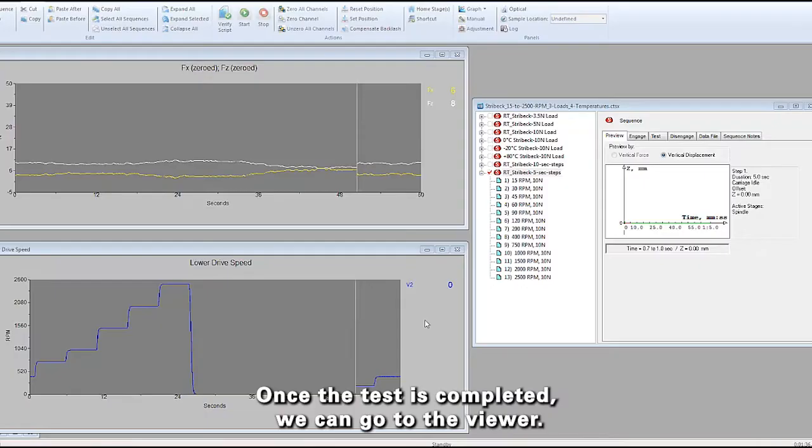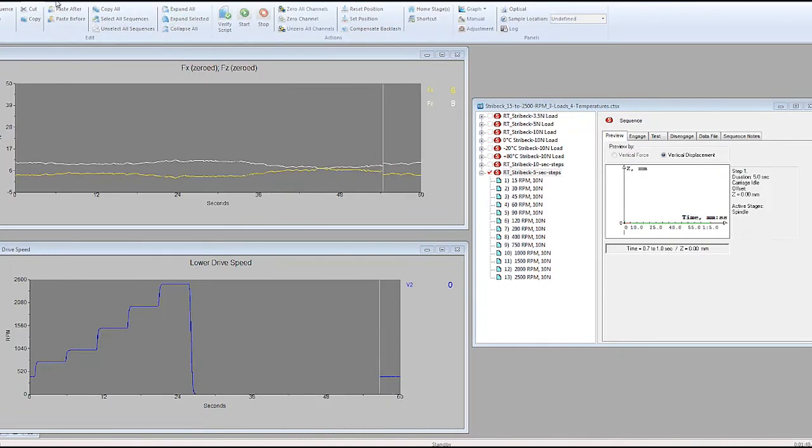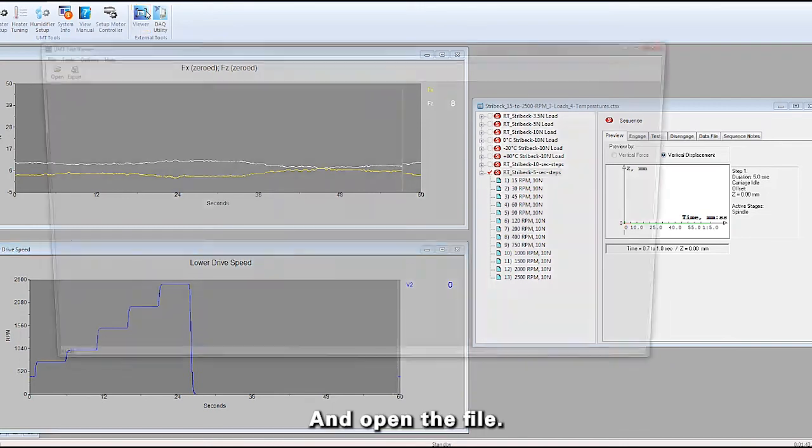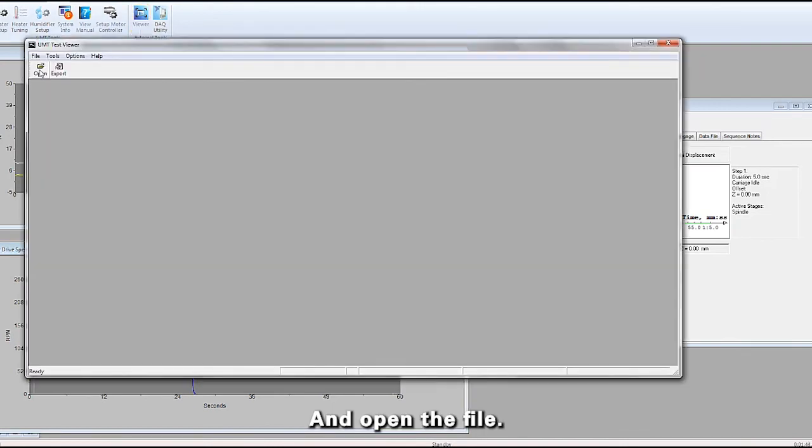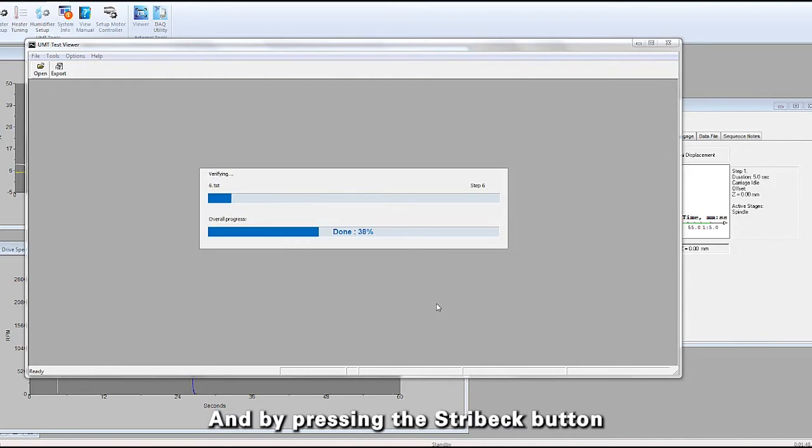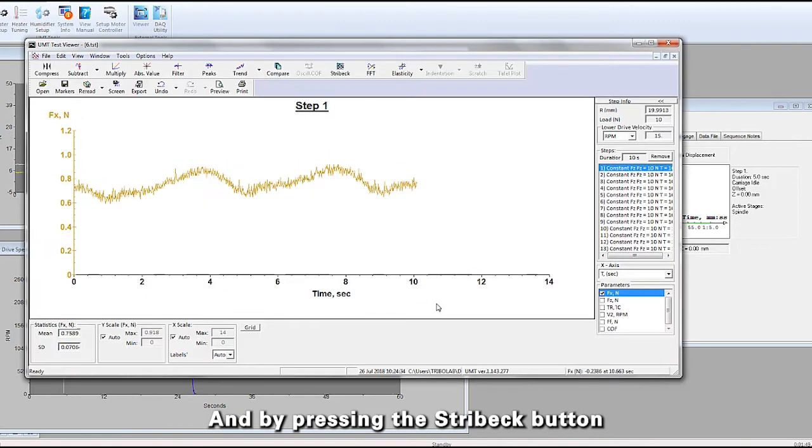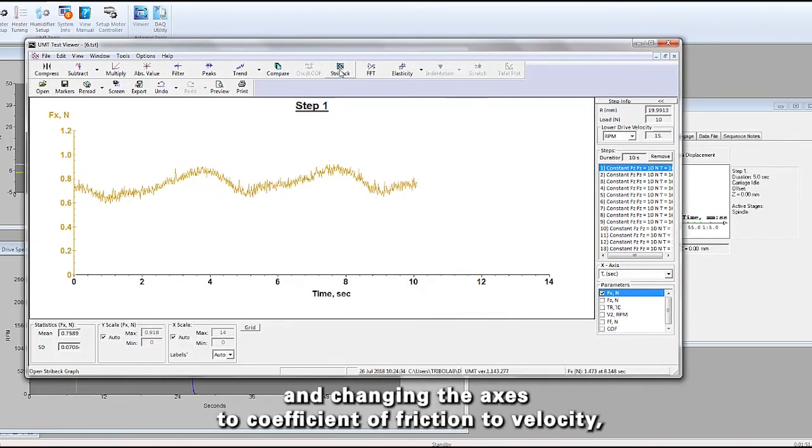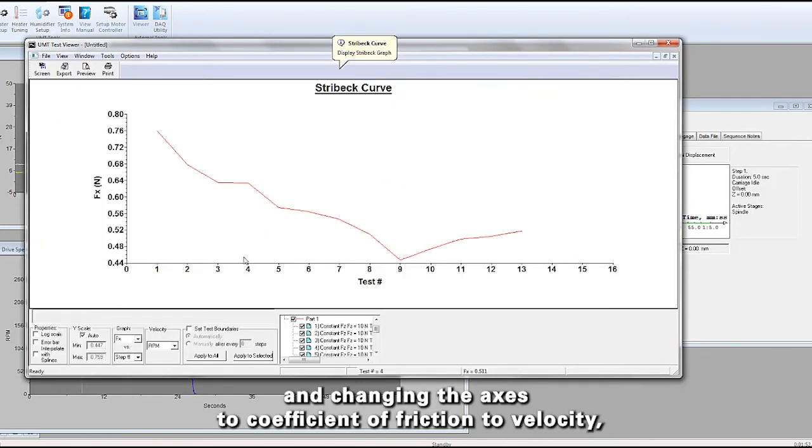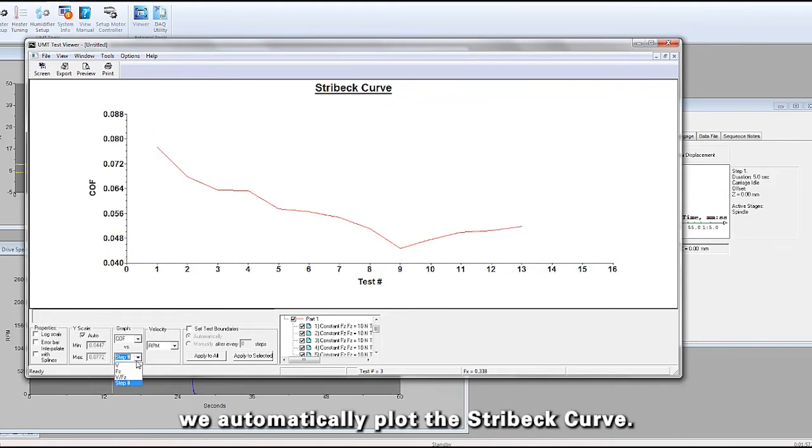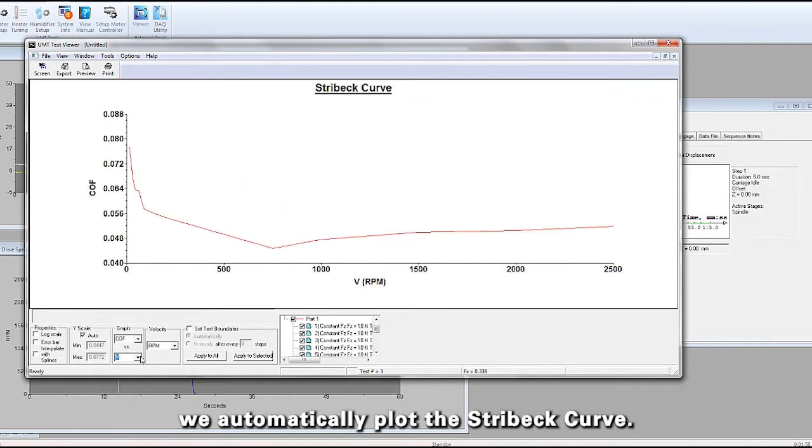Once the test is completed, we can go to the viewer and open a file. By pressing the Stribeck button and changing the axes to coefficient of friction versus velocity, we automatically plot the Stribeck curve.